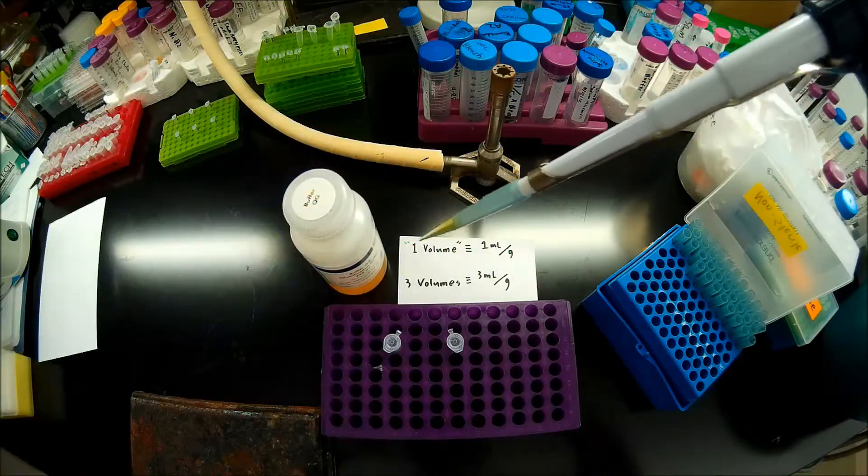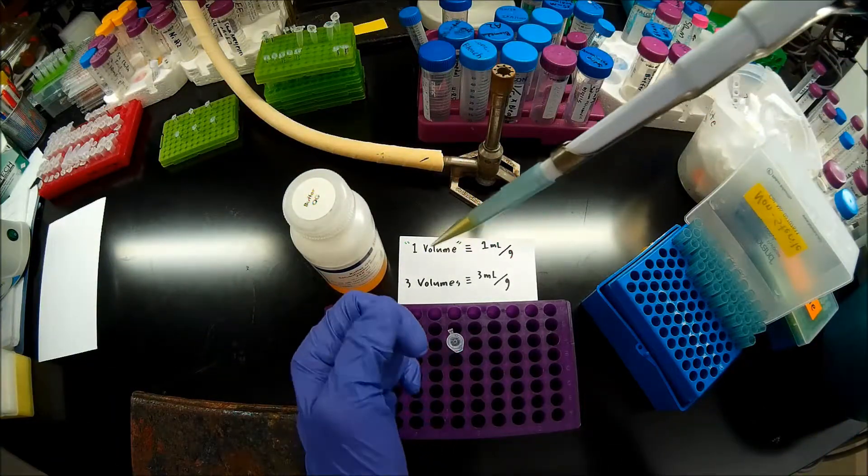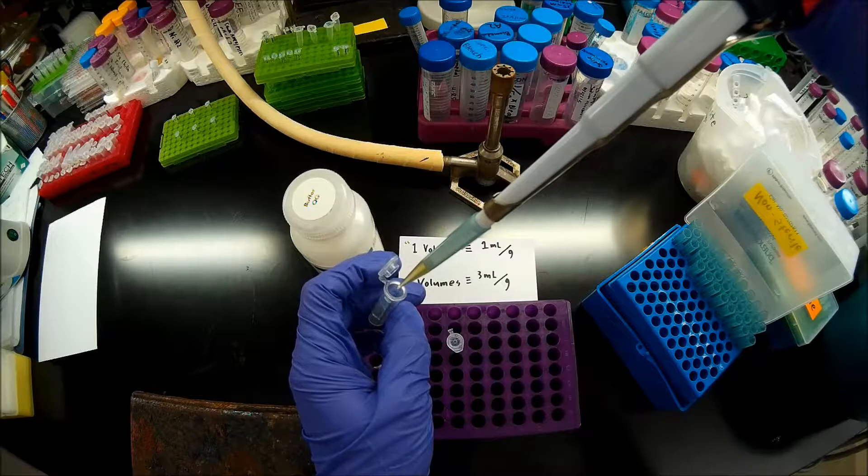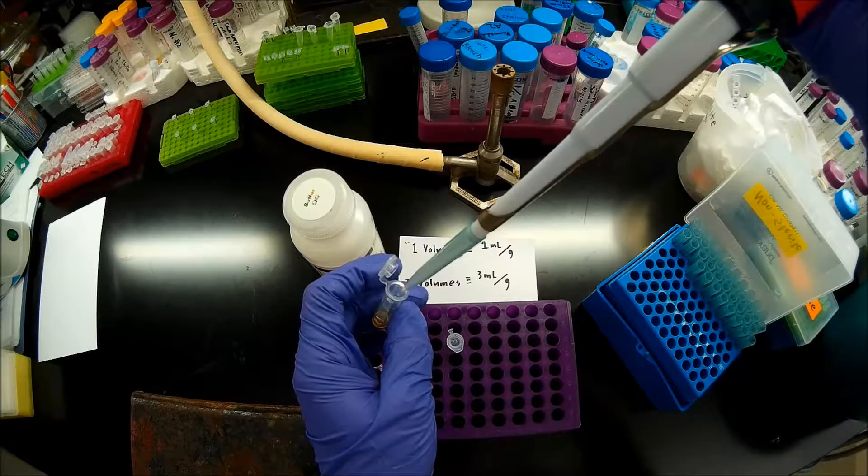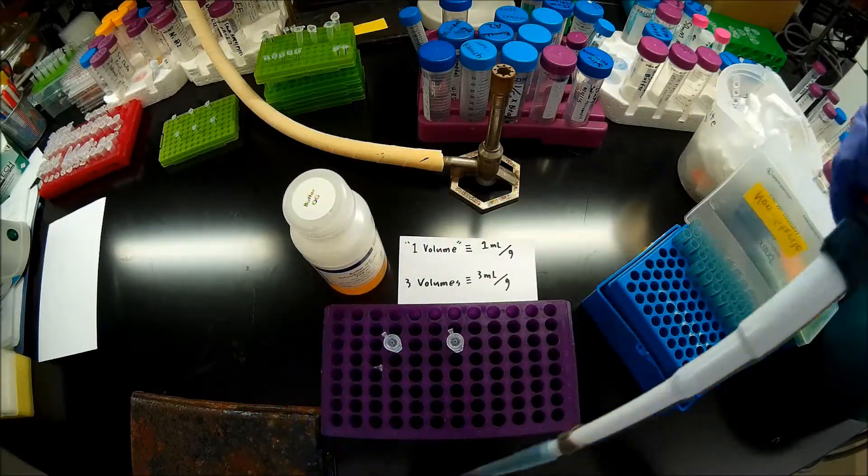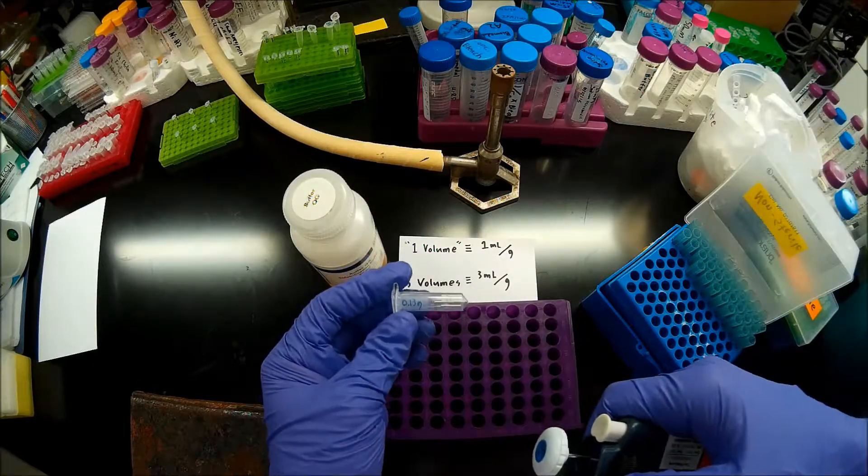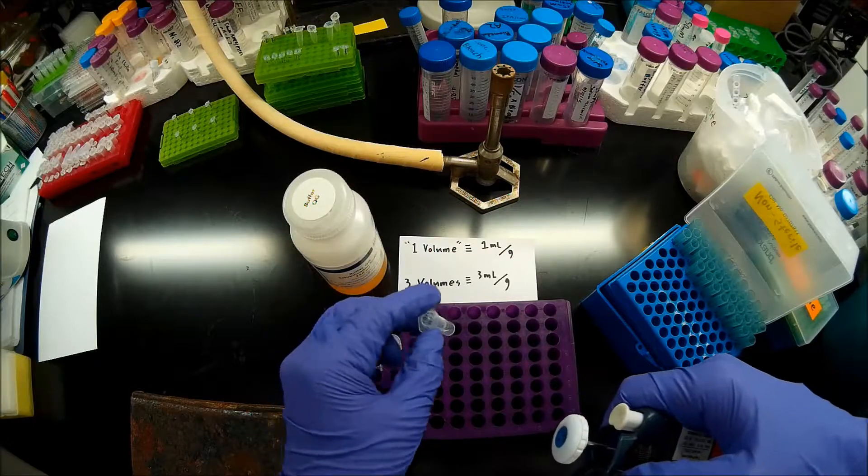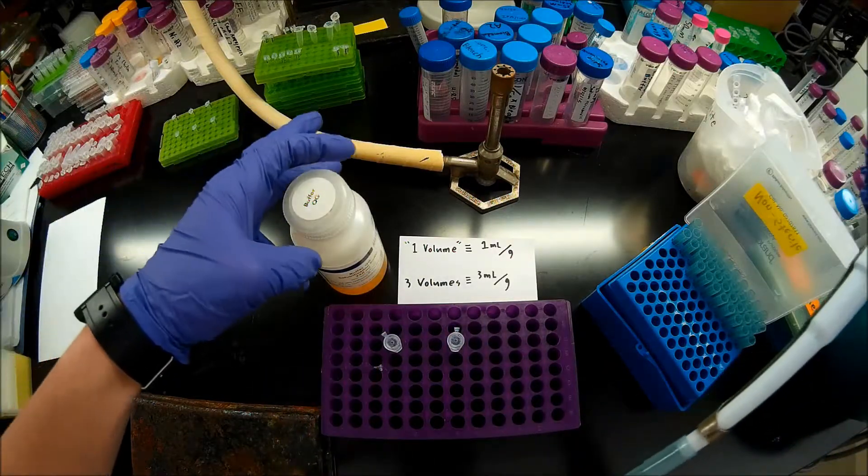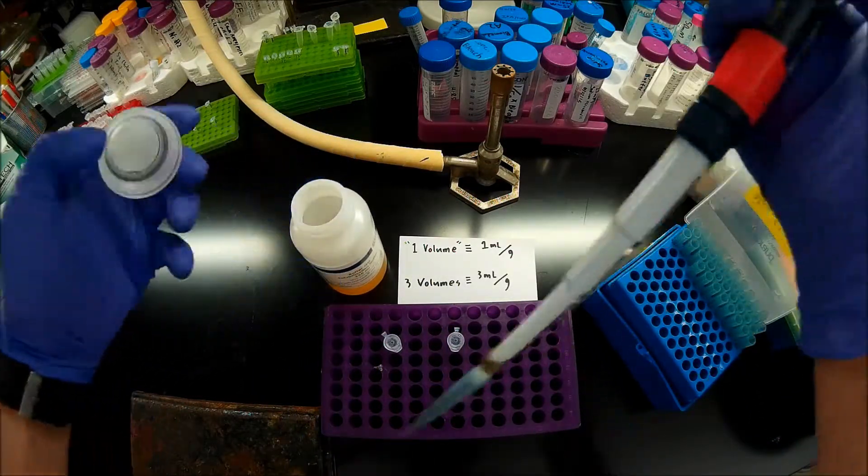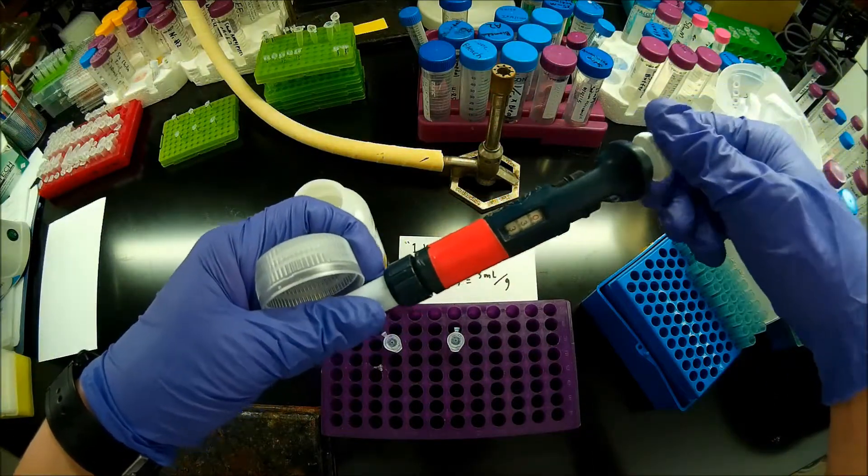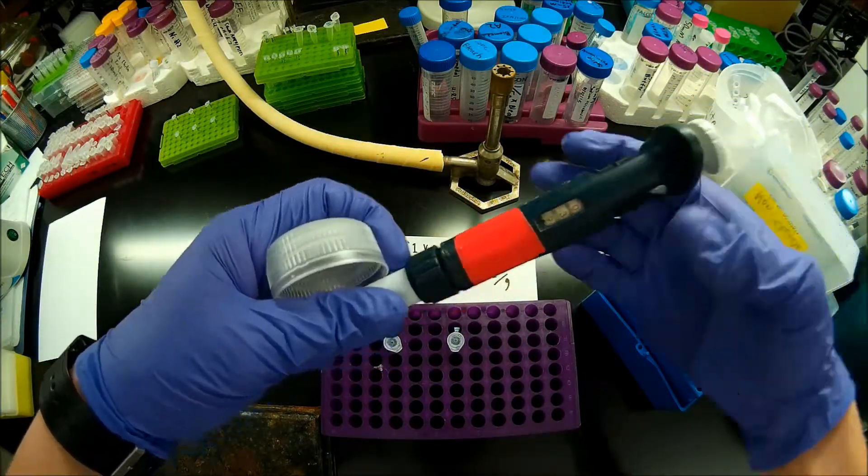The QG buffer contains guanidine thiocyanate, which is going to lower the melting temperature of the agarose slabs. So when we put it in a 50 degree water bath, it will melt. And this next sample contains 0.13 grams of agarose slab. So that's going to be 0.39 mils or 390 microliters.